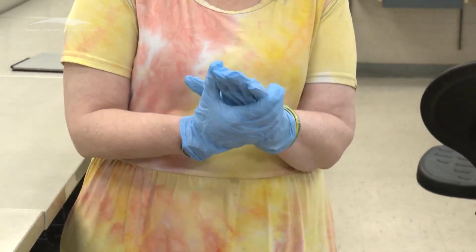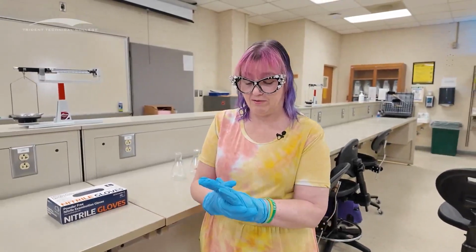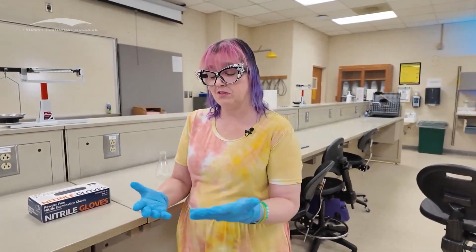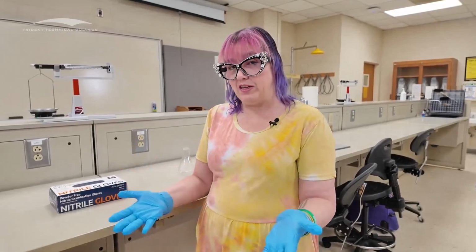Some people take their rings off before they do this. It depends on how big your rings are. I have ones that are tiny so I don't break through my gloves. That was a decision we made. But this is how I put them on. Putting them on is the easy part. Okay? Taking them off is not the easy part.